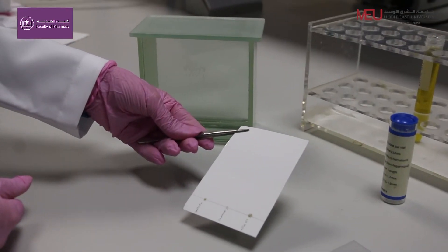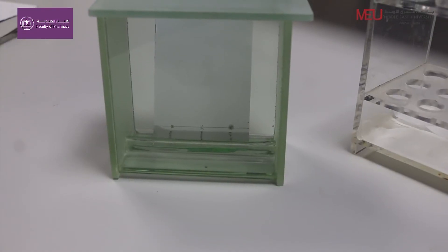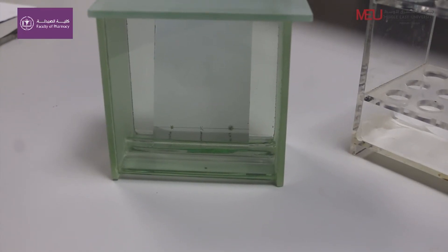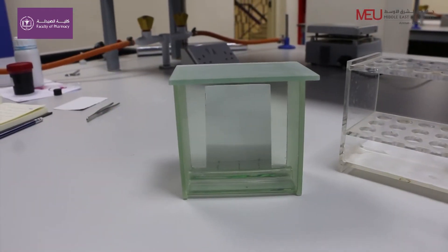Using the tweezers provided, place the plate upright in the correct mobile phase. Do not move the TLC jar once the plate has been placed inside. Observe the mobile phase rising up the plate, and when it is one centimeter from the top of the plate, remove it using the tweezers.